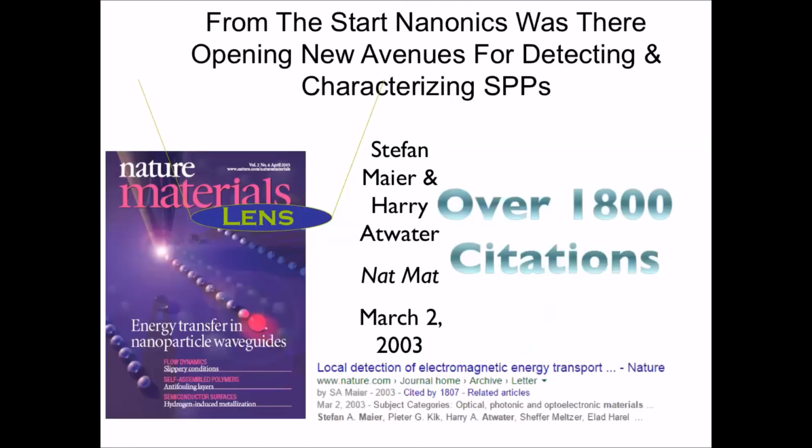This was one of the first papers published with our system. It was a series of silver nanoparticles and a fluorescent bead.